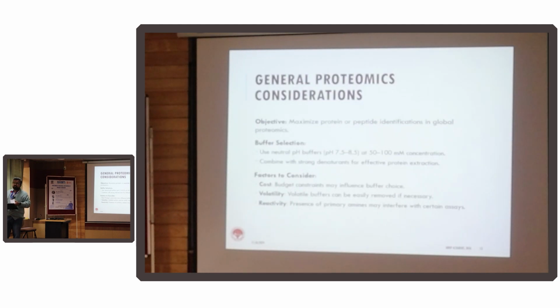Based on this mass by charge ratio, according to my database, this could be valine. Now if this valine gets amidated at one point, there's a high probability it will misidentify. And if it misidentifies one amino acid, most likely by a chain reaction, it will misidentify the entire protein. You don't want to do that, right?